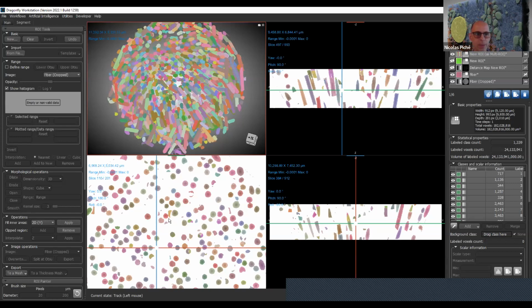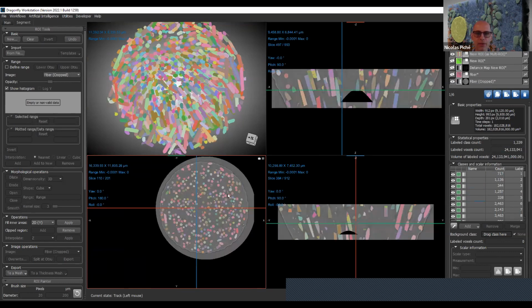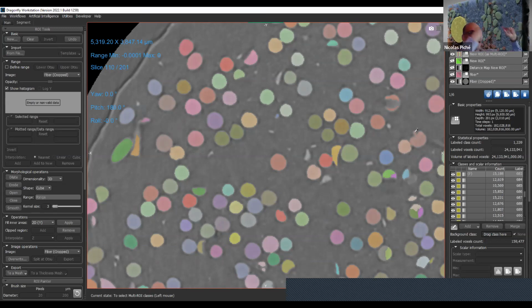Okay, I will go back to the basic segmentation tool. And I will use the multi-ROI that we have here. So I will hide that, and now I have just the tone of gray and the object here. If I pick this and click there, I think, yeah, it selects the object. So you can run into that, and click and select the object. Now they are color coded by label. It's an arbitrary number that comes from the creation of the object. So on the top of the data set on this slice, you will have label 1, 2, 3, and stuff like that.